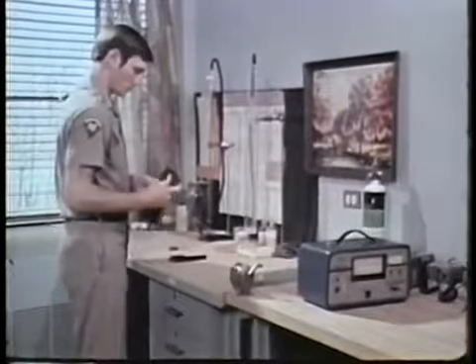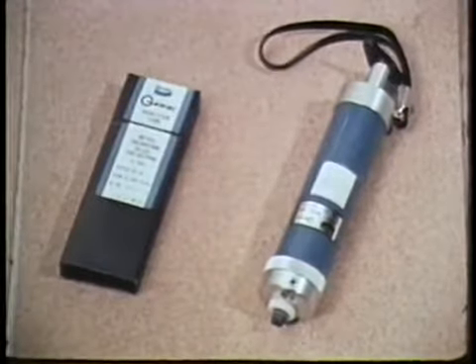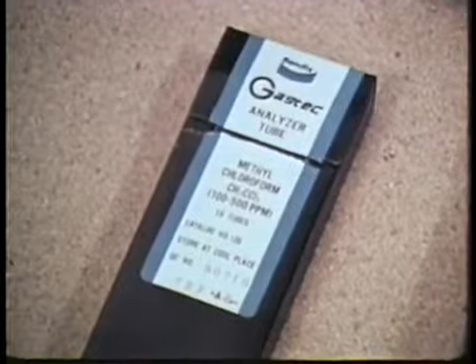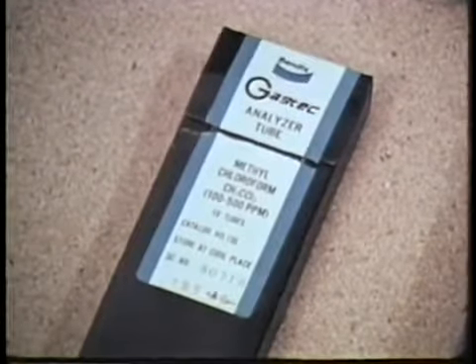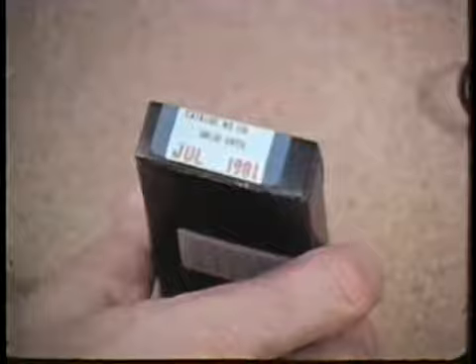To sample the vapors from the vapor degreaser at the motor pool, your survey team will be using this gas sampling pump and these detector tubes. Detector tubes are available for sampling many different types of gases and vapors. Make sure you have the correct type. Also, be sure the tubes haven't reached the shelf life expiration date.